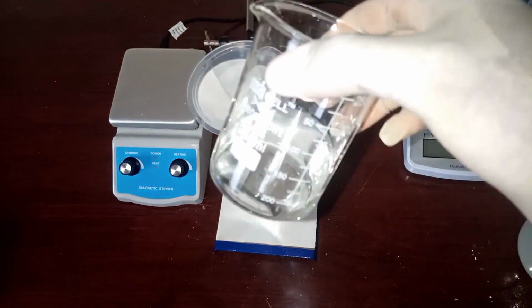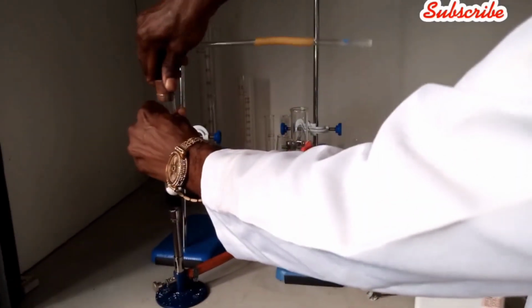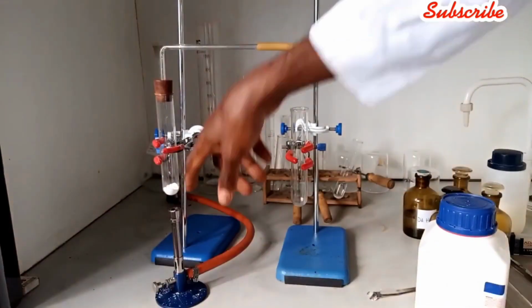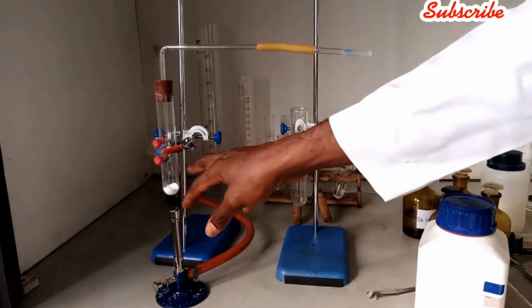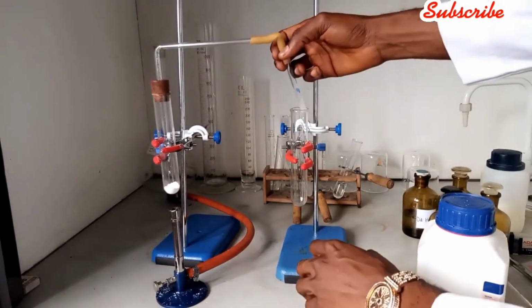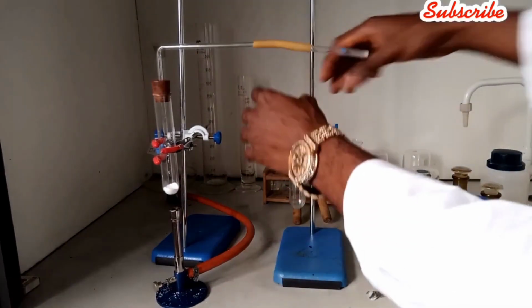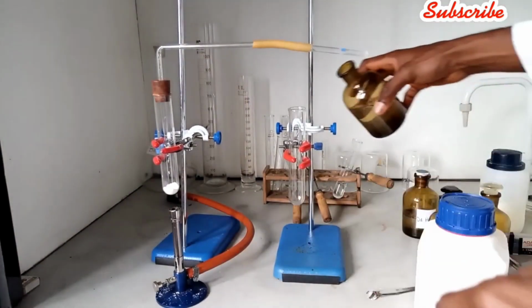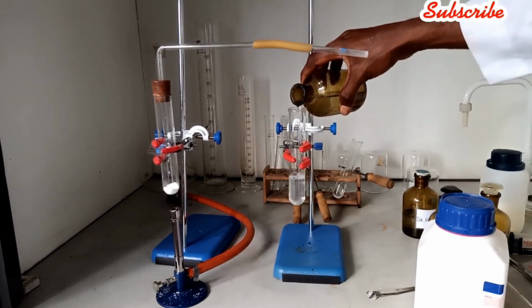And here we go. So here's some part of it. You can see how clear it is. So I'll go further to test the lime water. In this first boiling tube here, I have zinc(II) carbonate in it, so we'll be heating it to give out carbon dioxide gas. And in this other boiling tube here, I'll be adding my lime water into it, which is what I have here. So you pour your lime water into it carefully.